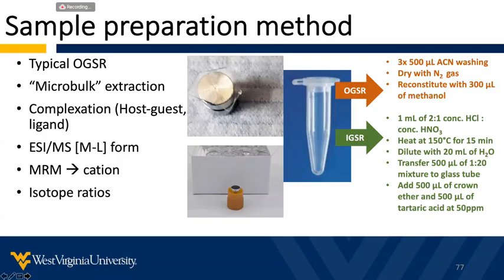Both work very well for the extraction and sampling. The extraction that we use for organic gunshot residue is typical. It is aligned with what most groups have reported in the literature. The inorganics are done with a microbulk extraction. This is essentially an acid digestion done directly in a microcentrifuge tube.